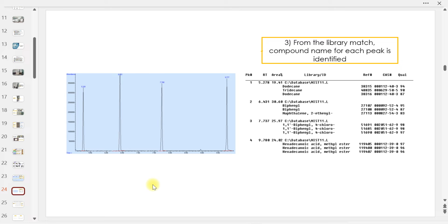Kalau you pergilah dekat fakulti sains, rasanya kalau UPM tu pun ada lecturer tu yang buat metabolomik pun cakap macam tu. Dia pun tak recommend 3. Dia recommend minimum 7. Minimum.